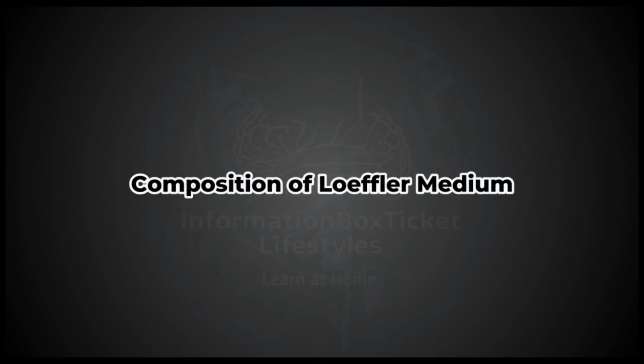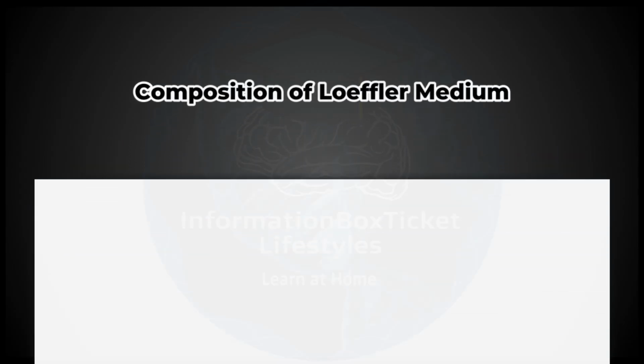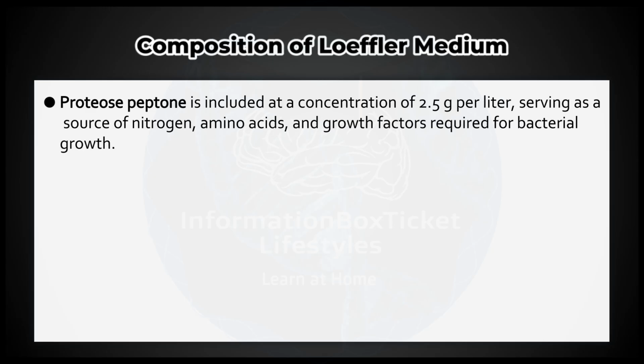Composition of Loeffler Medium. Proteose peptone is included at a concentration of 2.5 grams per liter, serving as a source of nitrogen, amino acids, and growth factors required for bacterial growth.